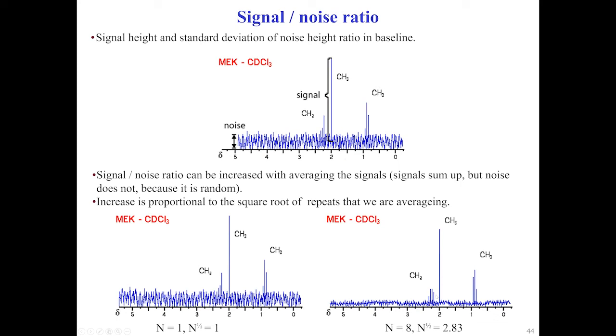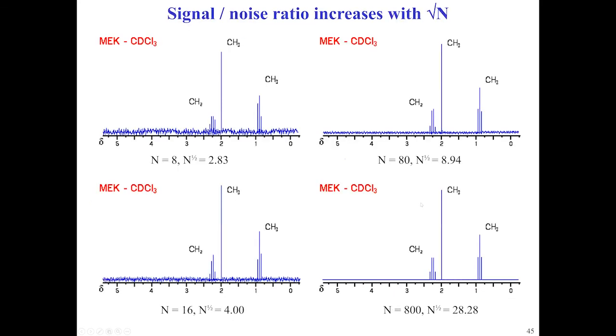And you see, in the old days, would you dare to say this is a signal and say, yes, you have this molecule in your solution, methyl ethyl ketone here. You see, you repeat this 8 times and the signal becomes more and more clear. So we have a way to get very good, unequivocal information with the number of repetitions of our NMR experiments. It goes, noise scales with the square root of the number of repetitions.